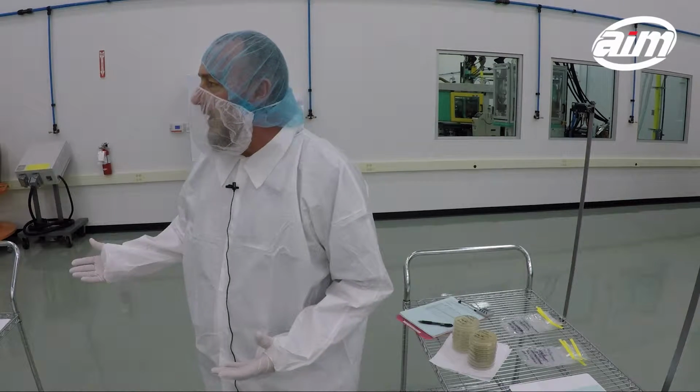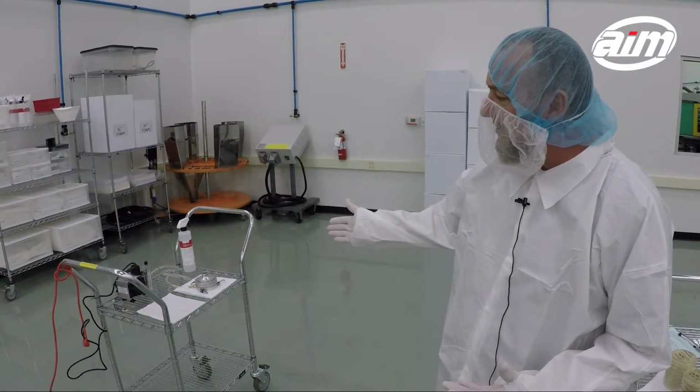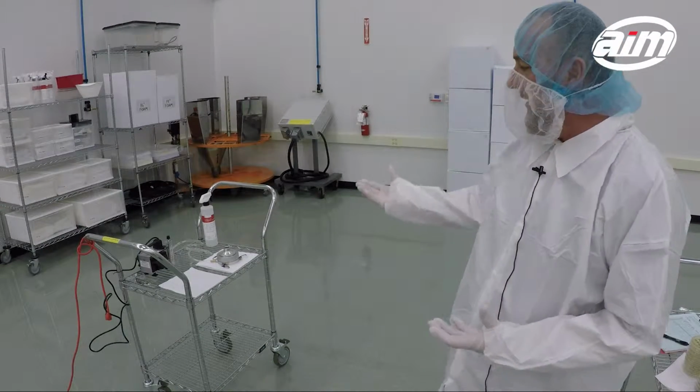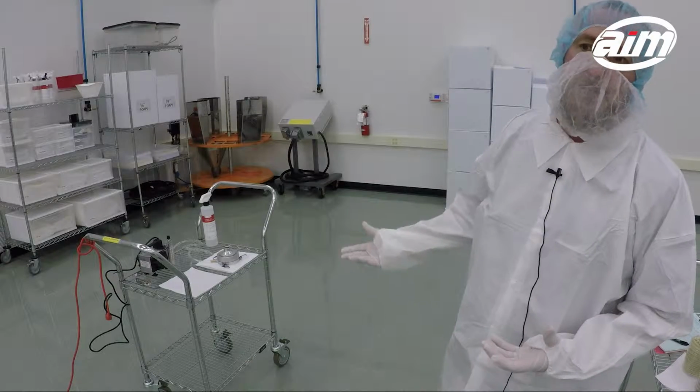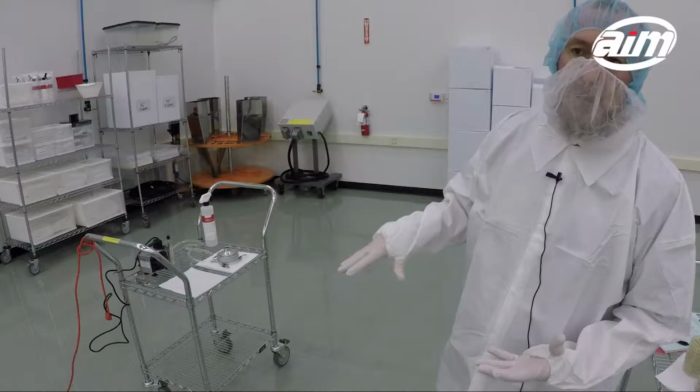What I have here is what they call an impactor, an impacting sampling device. Basically what it does is you put a petri dish with a medium on it in the impactor, and the vacuum pump draws air into the impactor and draws air on top of the agar medium on the plate.